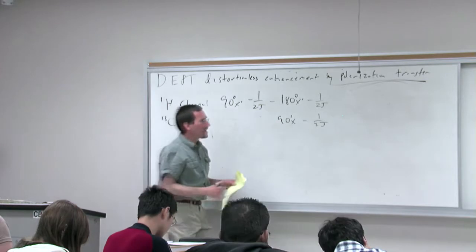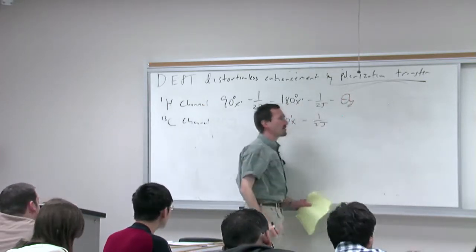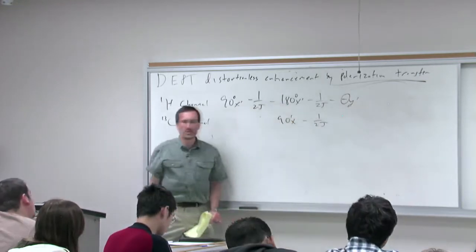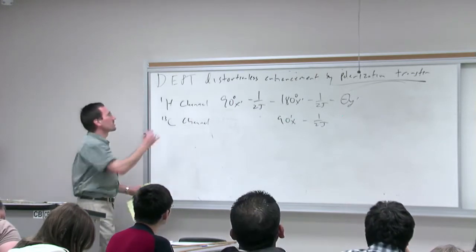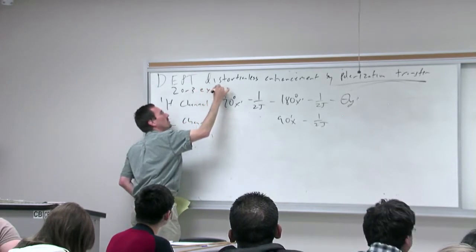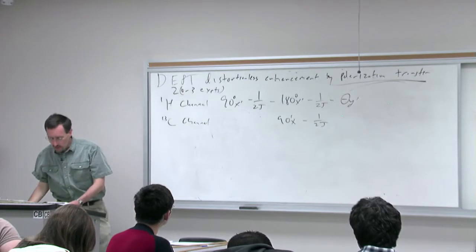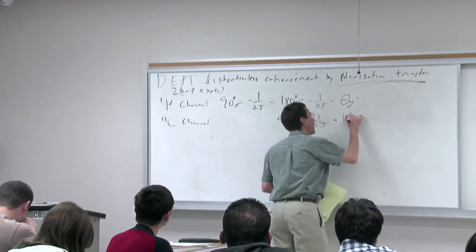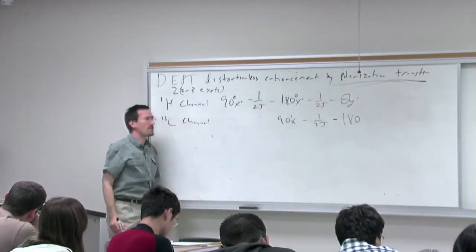Now you apply a pulse, which I'll show you in a second. We'll call that a theta Y prime pulse. That one's going to vary. You'll do 2 or 3 experiments. So while you're applying the theta Y prime pulse, you'll apply a 180-degree pulse in your carbon channel.